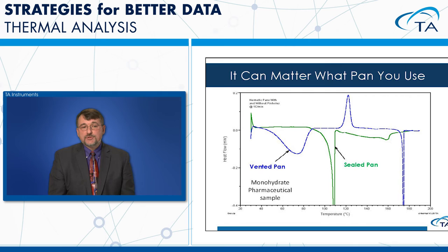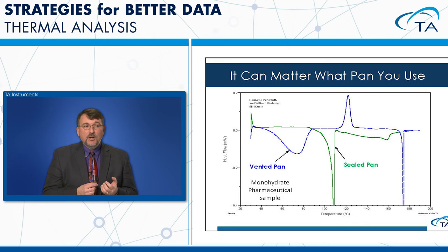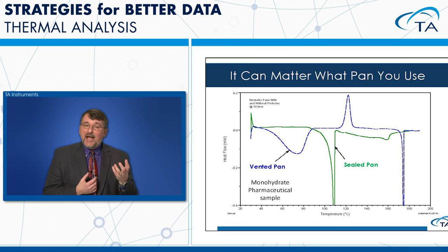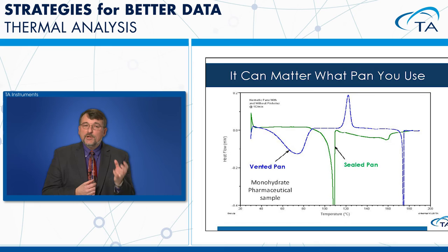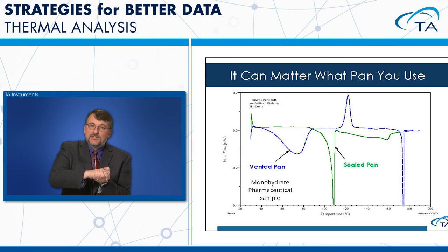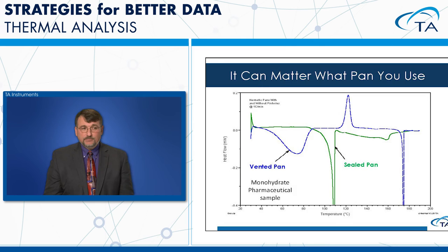Pan selection can significantly affect data. A pharmaceutical monohydrate sample illustrates this: the blue curve in a vented pan shows a broad endotherm from hydrate volatilization, followed by recrystallization and then melting. In the green curve using a sealed pan, the data is dramatically different — the hydrate is retained. If you want to characterize the sample as a hydrate, run it in a sealed pan. Sometimes you may want to run it both ways, but the pan type can change your data significantly.